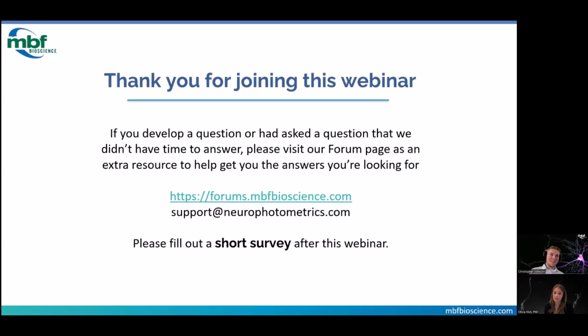Yeah, you can control the amplitude, the frequency, and the pulse width all dynamically within the workflow. So if you have, instead of a binary true or false on whether a peak is occurring, an indicator that's analog, then you can pass this through some Python logic to generate your target frequency or pulse width or amplitude, and then we can send that command to the opto stimulation instead of just start opto stimulation. So yes, you can dynamically change your pulse train while it's running based on your indicator.